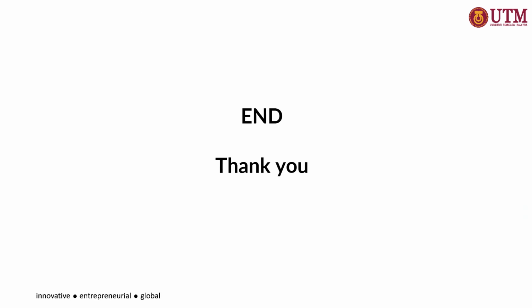So that's all about the material characterization techniques and guide for final year project students. I hope that you can have some insight about how you can present your data and what you should do, for example, the pre-treatment or conditions that you should prepare for your sample to obtain good results. So that's all for today.